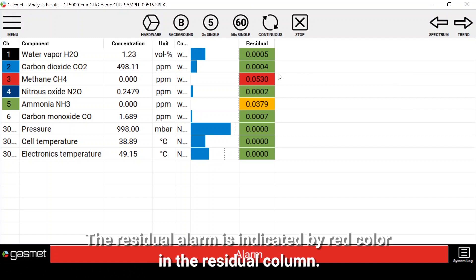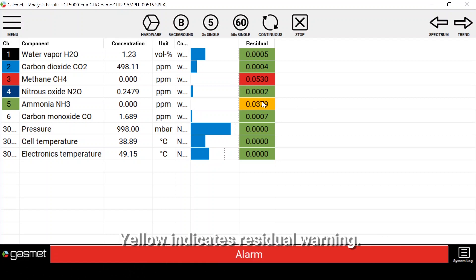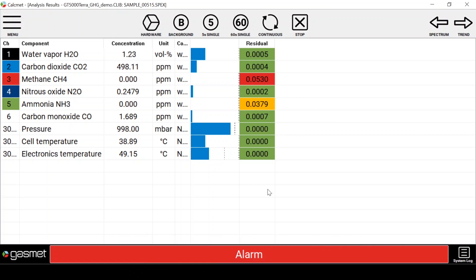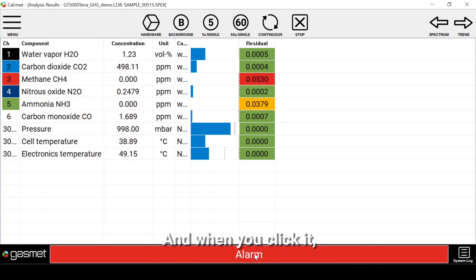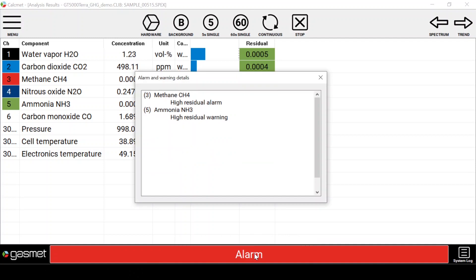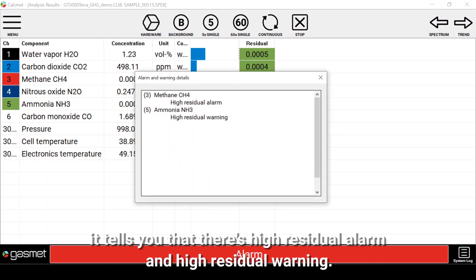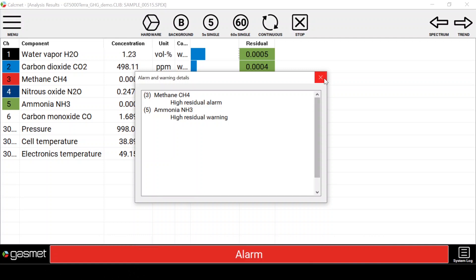The residual alarm is indicated by red color in the residual column. Yellow indicates a residual warning. In Calcmet Easy you can also see the alarm in the bottom banner, and when you click it, it tells you that there is a high residual alarm and a high residual warning.